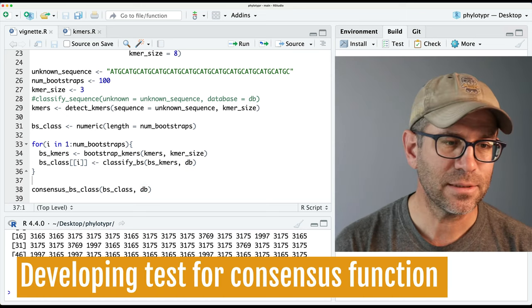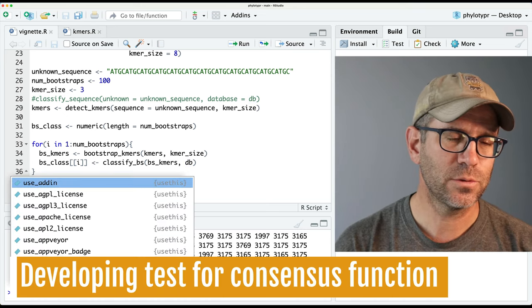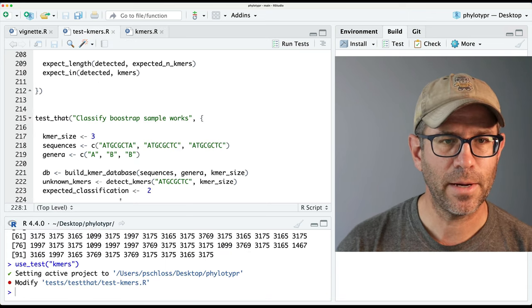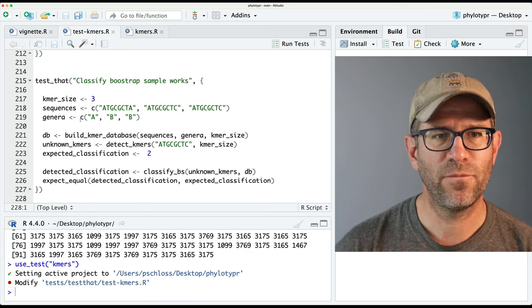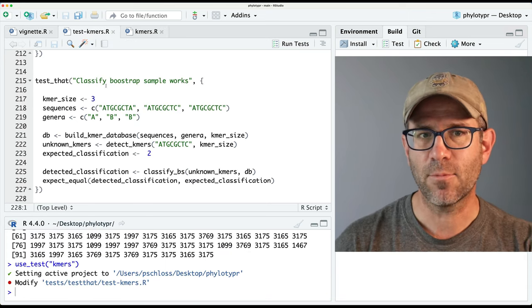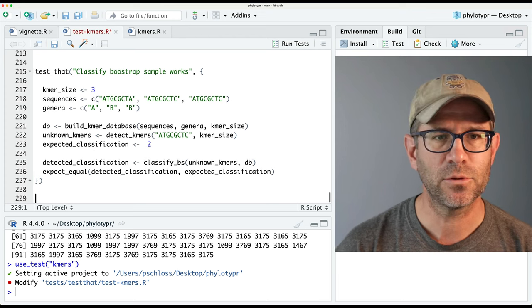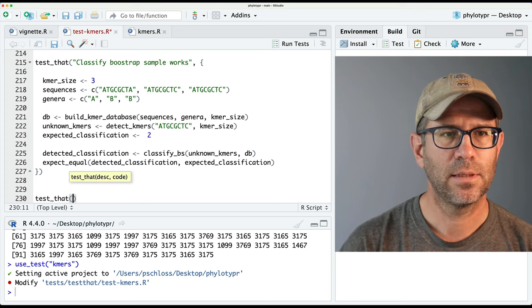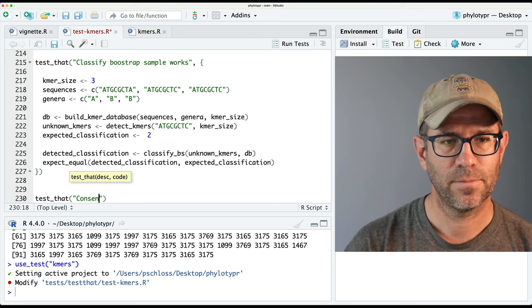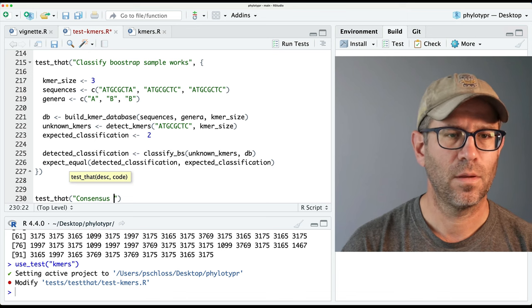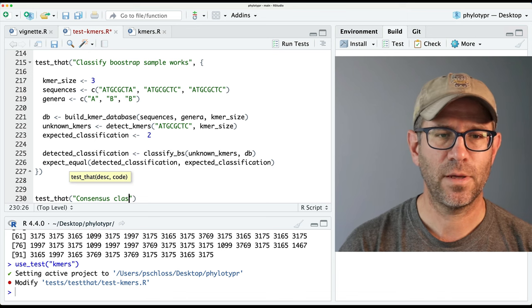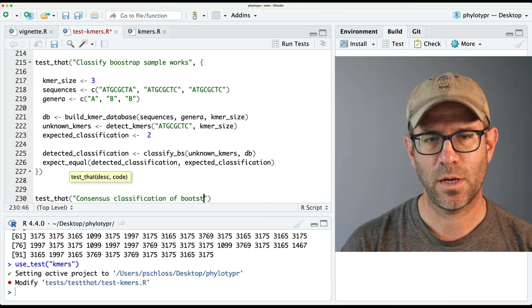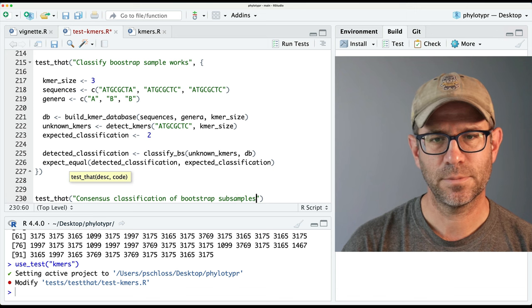I'm going to start with a test. So we'll do use_test on kmers, and this should open up my test file. We finished last time with 'classified bootstrap sample works,' and I will do test_that 'consensus classification of bootstrap subsamples.'